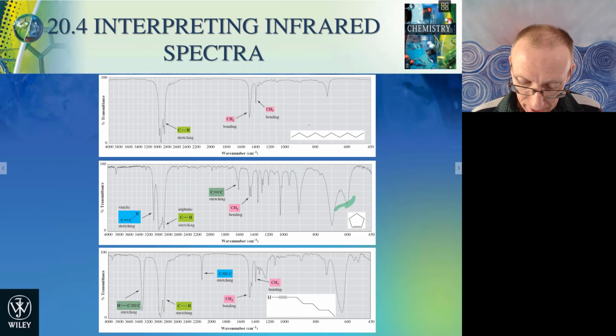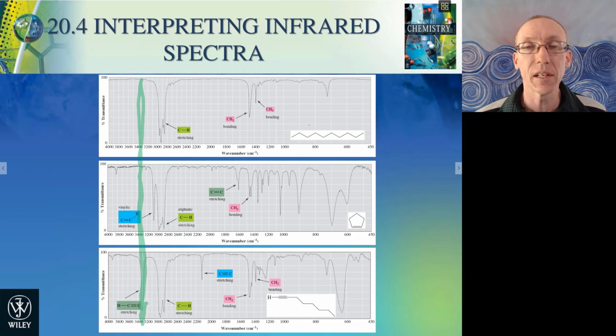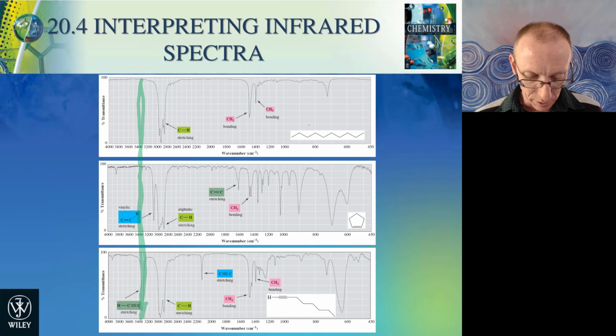So it's only fairly moderately intense, and then we've got a variety of peaks in this fingerprint region down here. And then finally we've got an example of an alkyne. So this is a terminal alkyne that has a CH group. So here we can see the CH group all the way down here at about 3,300. And that's completely missing from the other 2 spectra. So you can see it's much higher frequency because of that stronger bond between a hydrogen and an sp hybridized carbon atom.